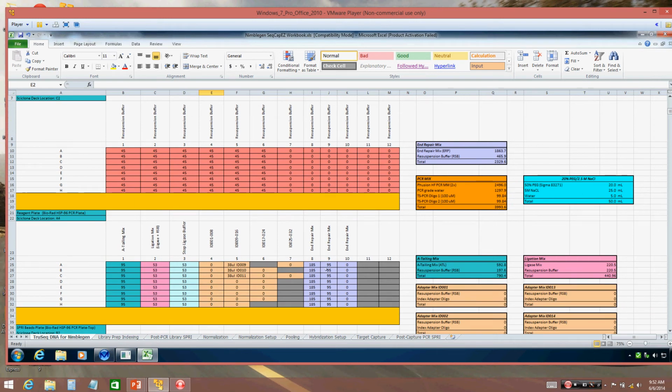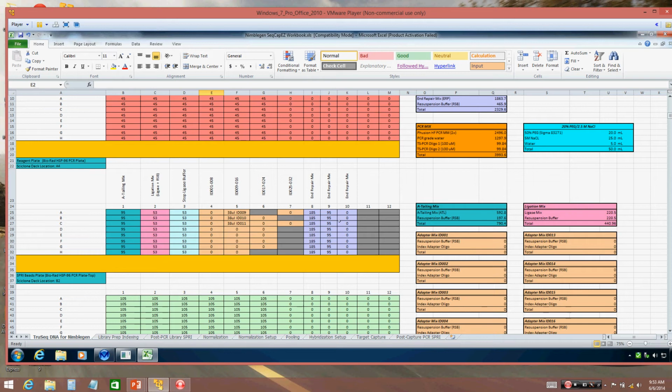If we look at where we put it into the destination plate, it's now 185, and since we're running more columns, it says you need to add 95 to the adjacent column, which is column 9. If you were to do a full plate, column 10 is empty right now because it doesn't need to go into those wells, since you don't have to worry about overflow.